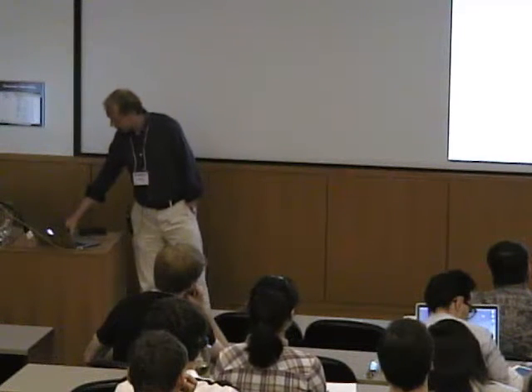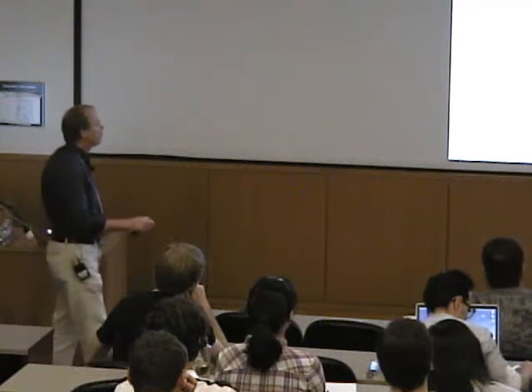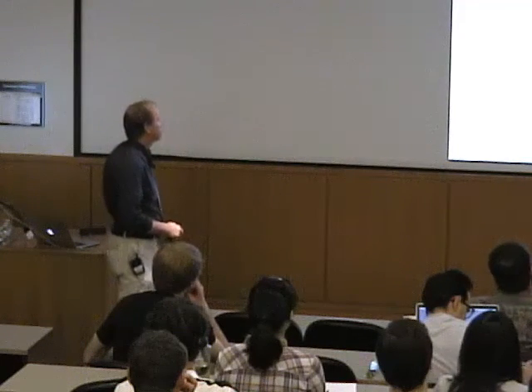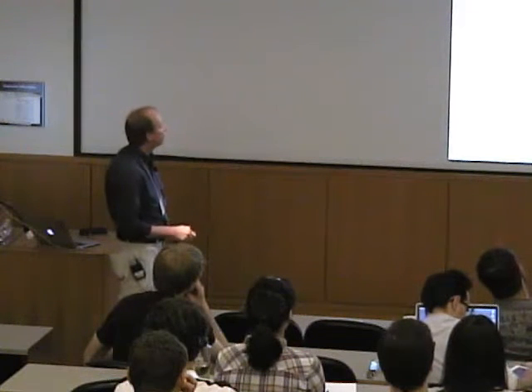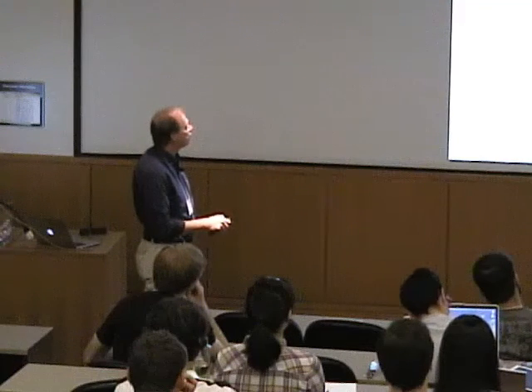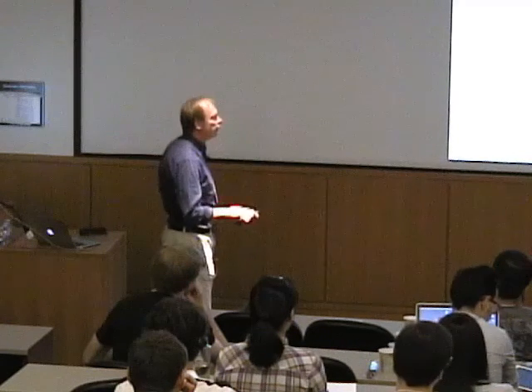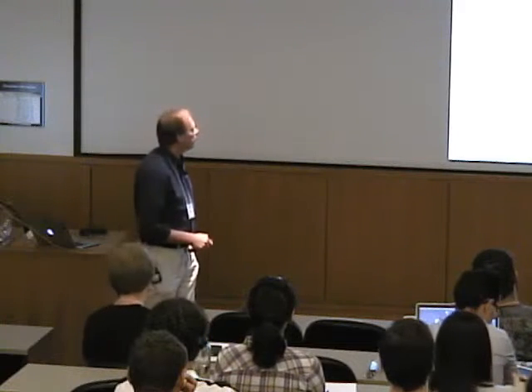All right, so if we want to do a spectroscopic experiment, the way that we do this usually is we take our sample and we put it in some kind of a holder, right? If I'm going to do a UV-visible spectrum or IR spectrum or something, I put my sample in some kind of cuvette. I have a source. I shine my light or electromagnetic radiation through it, and I measure how much of that is absorbed by the sample, right? And then I can work out the absorbance as the log of the ratio of the initial and final intensity, right? We can't do things easily this way if we're going to do EPR, right?